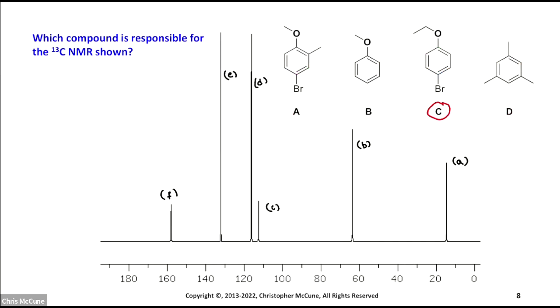So just labeling this for you, A, then I have B. Now I've got a bromine on here. So this one's going to be F. And then this, I believe, is E and D. So I'd have to check on E and D, but the lone pair on the oxygen can donate into the ring a little bit better than the bromine.